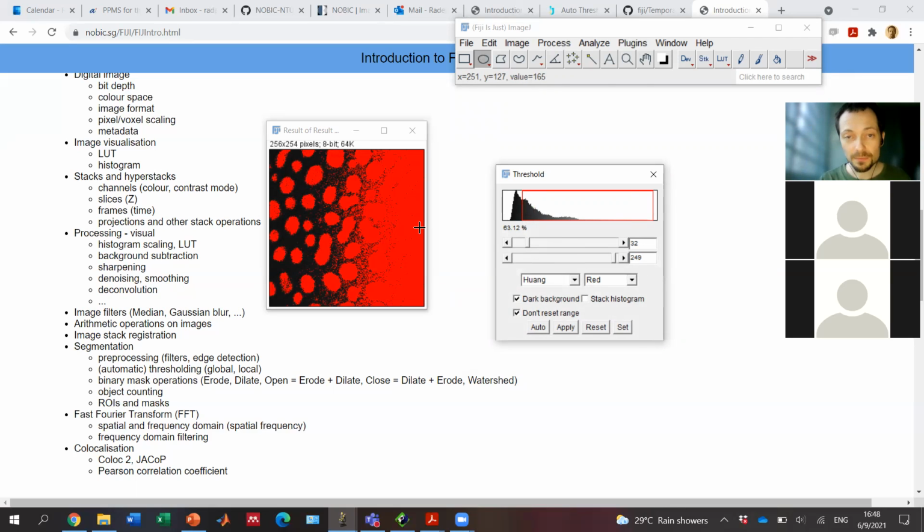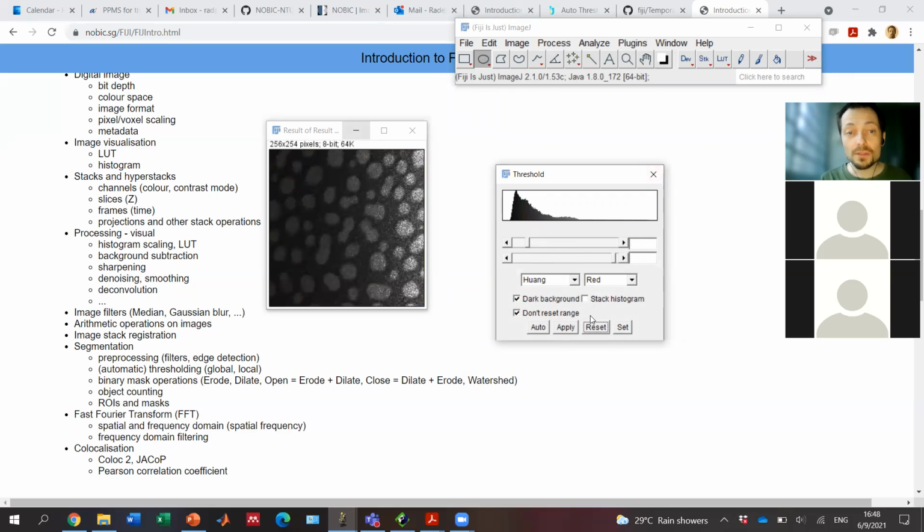Obviously, because on this side, the background has higher intensity than the objects on this side. So thresholding won't work in this case. Even though by eye I can clearly see where the objects are, I need a smarter approach.